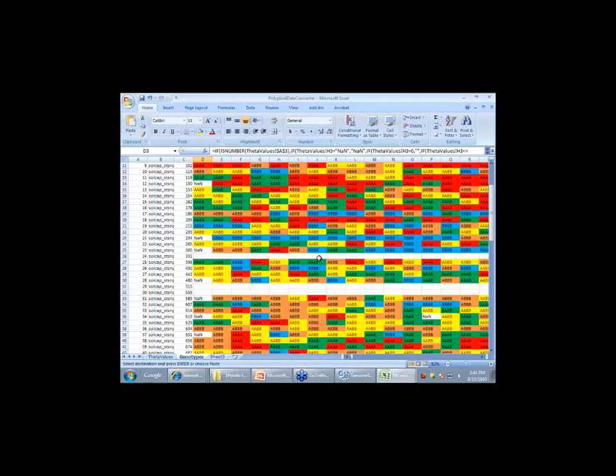So right now we've basically generated our own cluster files based on the theta values. And it seems to work pretty well. I know Dave Douches has looked at this data relative to others, and it seems to make sense.